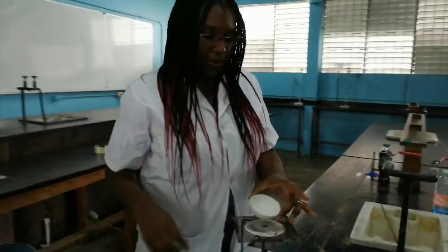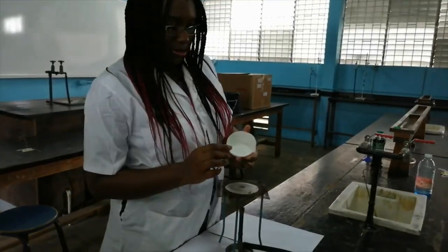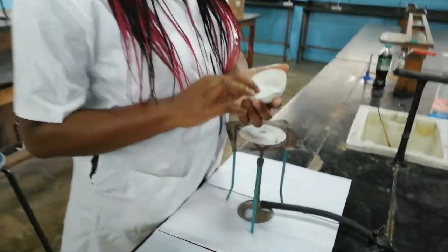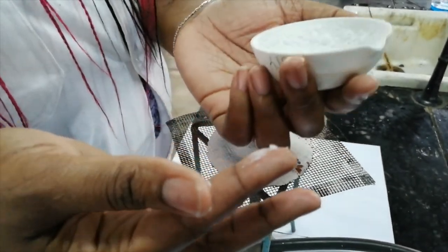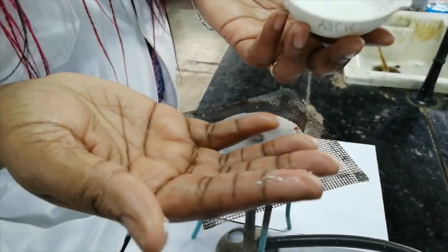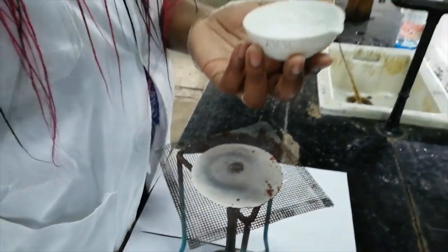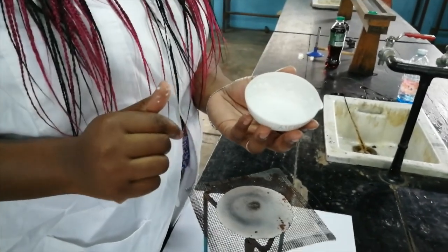In the evaporating dish we now have the table salt that's quite caked together. It's very soft and still a bit moist because it needs to dry down a little bit more; however, these are powder-like in consistency. They're not crystals like what you actually have in the bag. Why? Because we did not go through the process of crystallization.